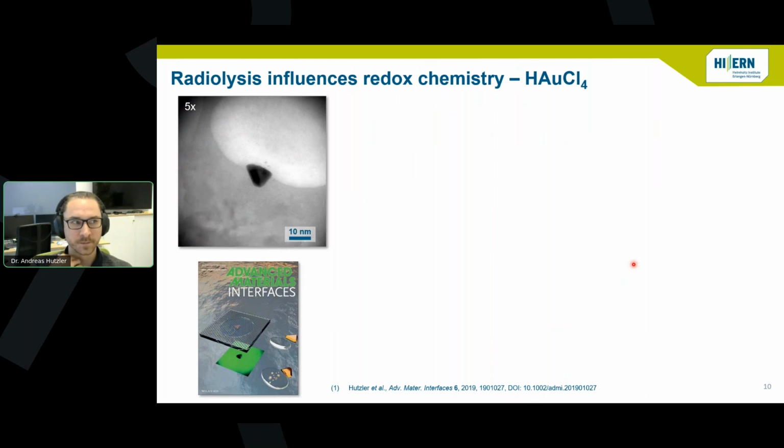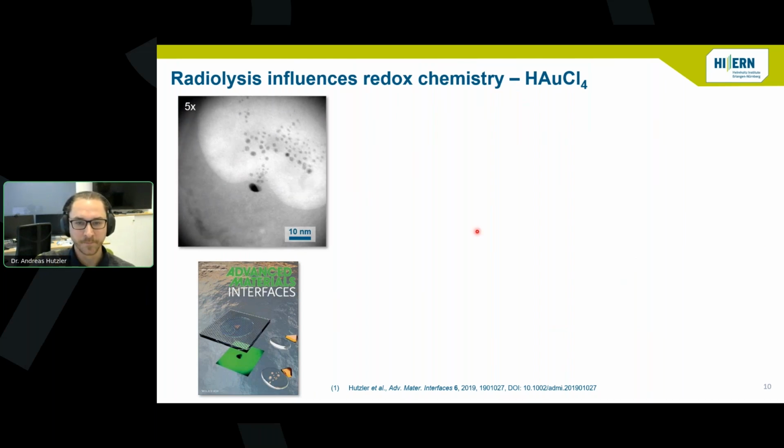So let's see what we can do with our radiolysis modeling. Therefore, we look at another experiment that we did in 2019. Back then we weren't able to simulate all of this; we just made this nice observation. We saw a gold platelet in a chloroauric acid solution, and this obviously dissolves when it's in contact with a gas phase, so with a gas bubble here.